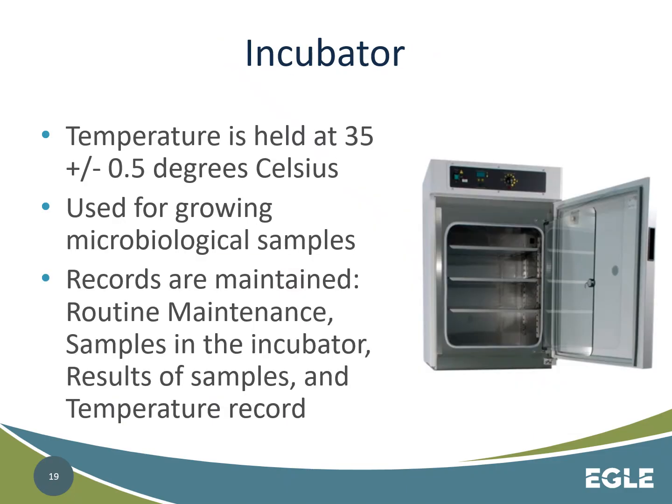Now in a lab, we use incubators. So incubators have a standard temperature of 35 plus or minus 0.5 degrees Celsius. They're used for growing bacteria samples. These incubators range in various sizes, depending upon the lab and the uses for them. Typically, incubators have 2 thermometers in them. They're total immersion thermometers, typically an oil solution at the top and bottom, and these temperatures are typically recorded twice per day.